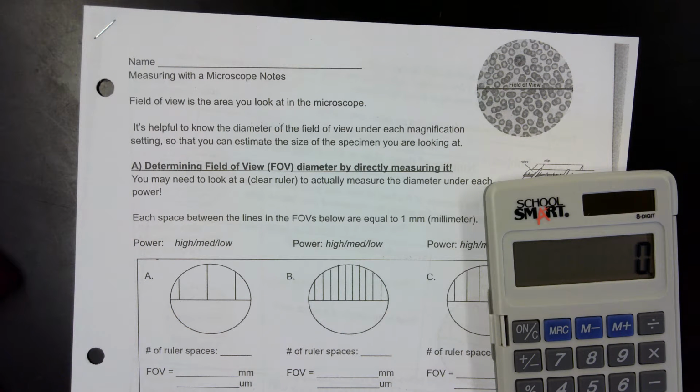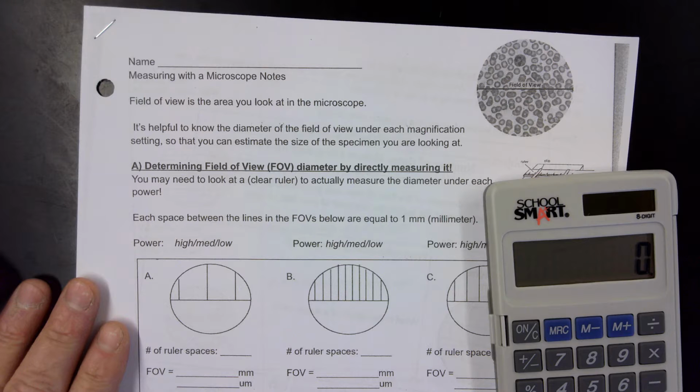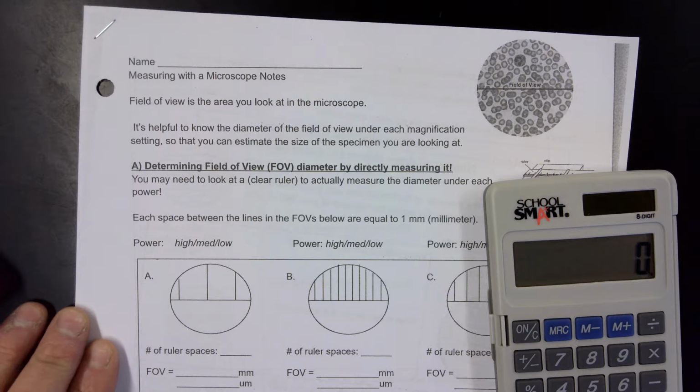So this video is meant to help you understand how we measure the field of view in a microscope. It's really important to know the field of view in all of the powers of your microscope so that you can estimate the size of specimens that you are looking at. There's definitely some math involved, and a calculator will definitely be helpful. We have these notes that I prepared for you, and let's dive in.